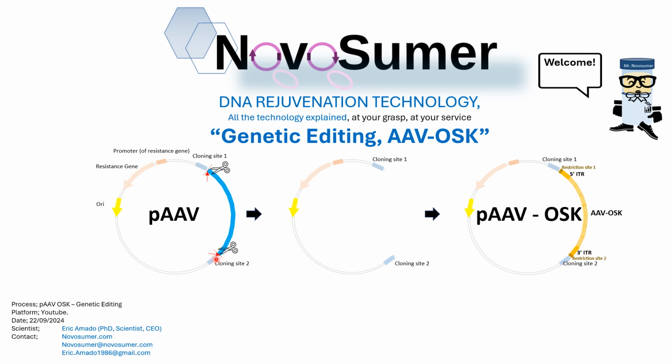Let's go to see the genetic editing, which is just having the sequence, deleting the region that we don't want, and afterwards copy pasting the DNA sequence that we want. Okay, and we're going to use text editors, a very easy text editor that all of us know, that is Microsoft Word. Let's go for it.